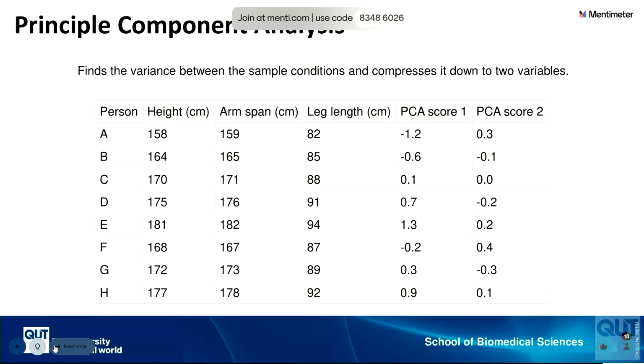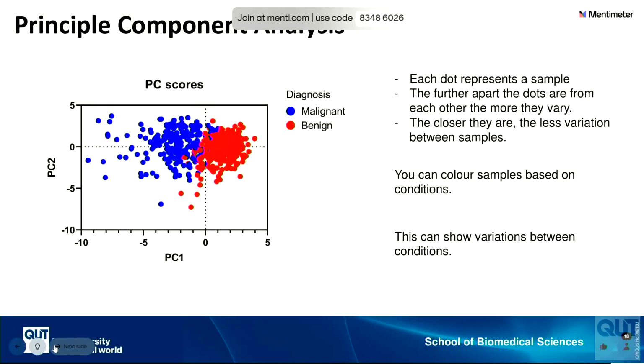And if the difference between principal component 1 and principal component 2 is the primary variation, the biggest part of that variance goes into principal component 1, and then the leftover variance goes into principal component 2. Don't worry about the math behind it. You get into vectors where we're talking about direction and size. Don't worry about that. You don't need to know about it. What you essentially need to know is how to read a principal component analysis plot.